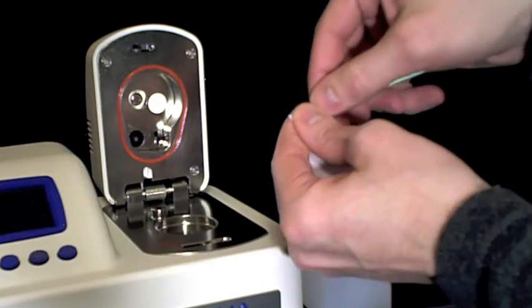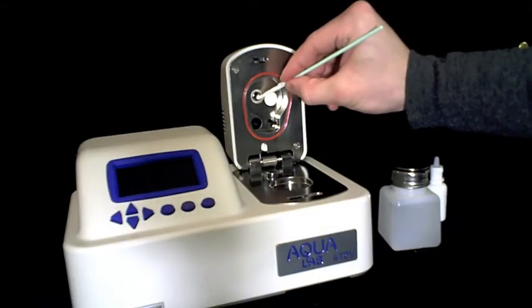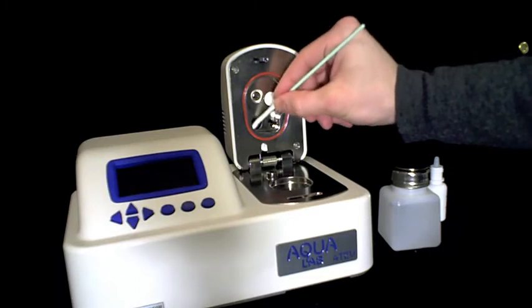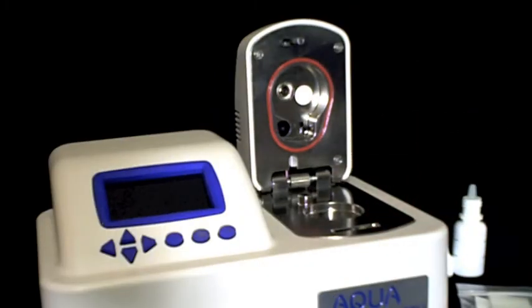Lastly, take another clean kimwipe, apply no solution, and dry the surface of the thermopile, the mirror, and the optical sensor to make sure there is no residual moisture.